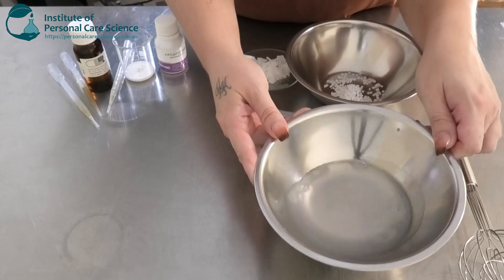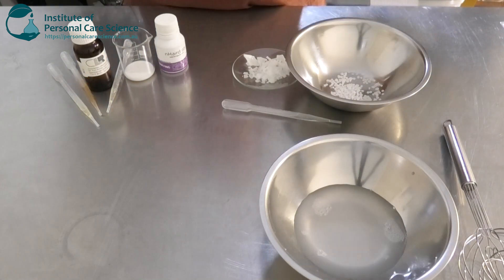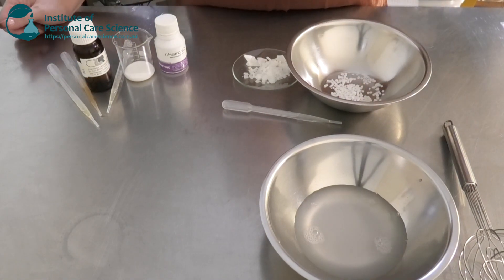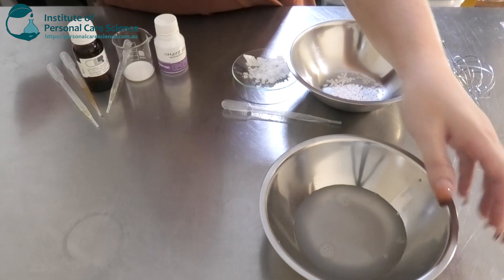As you can see, the guar gum hasn't really added any viscosity to the water at the moment. Guar has a low viscosity impact generally, so we're going to be relying on our emulsifiers for viscosity in this case. I'm going to add that on heat now.